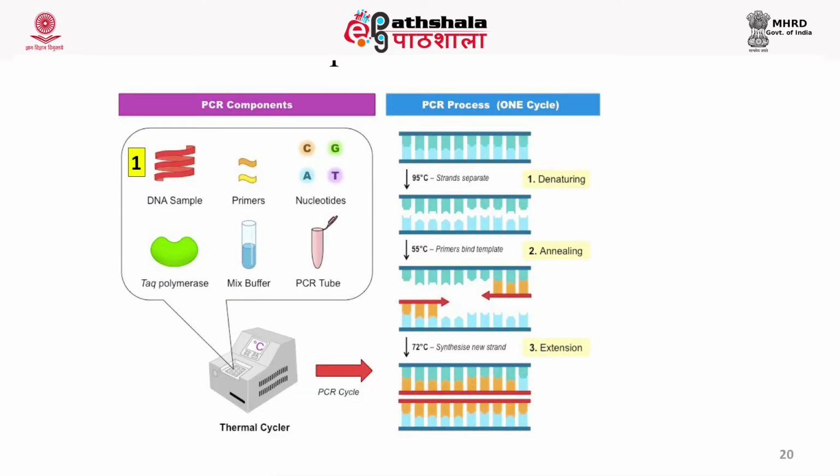In this figure you can see DNA which is marked in red, and then there is a target DNA which is the DNA to be amplified. To target this DNA and amplify this DNA, primers are designed to the flanking region of this DNA. So we need a good quality starting material, that is DNA template for PCR reaction.